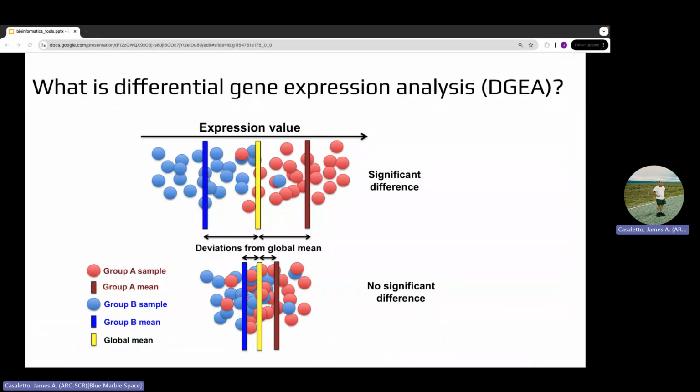Differential gene expression analysis is a statistical experiment scientists perform on RNA-seq count data. There are two groups of interest, say A and B, one of which is the control group, to which no changes were made, and one of which is the experimental group, to which some change was made. The experimental change can be anything, such as treated with a drug versus untreated, or other so-called changes like male versus female, or old versus young, strain 1 versus strain 2, smoker versus non-smoker, etc.